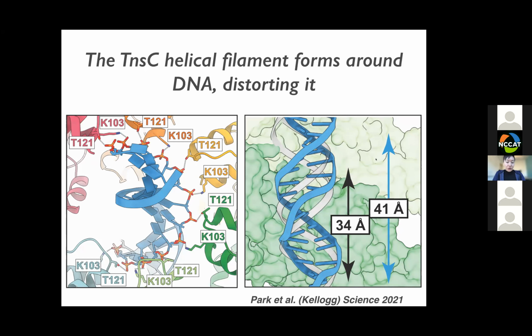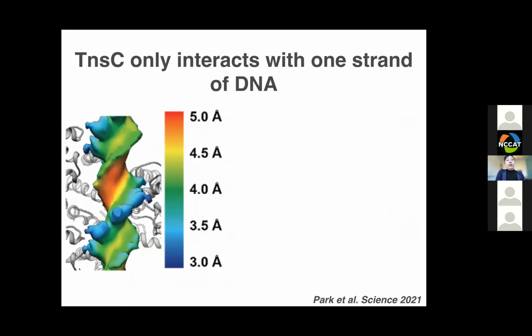that represents the resolution of that reconstruction, but there is usually a range of what we call local resolutions throughout the structure. And when we look at the local resolution of the DNA in this Cryo-EM reconstruction, we see the following. I've segmented out the DNA from the map I was just showing you, and I'm showing you the local resolution in terms of the color. If it's a higher local resolution, it's going to be more towards the blue, and if it's a lower local resolution, it's going to be towards red.